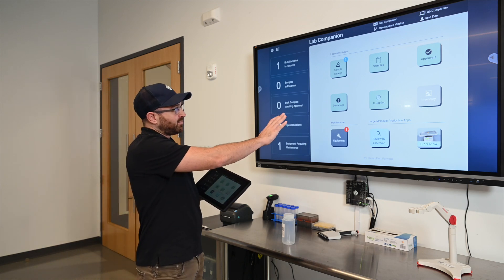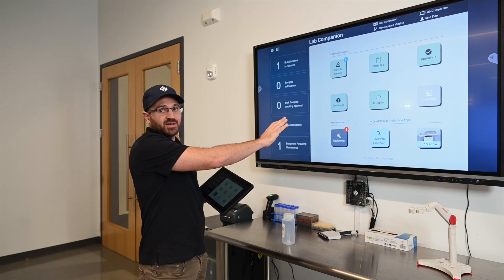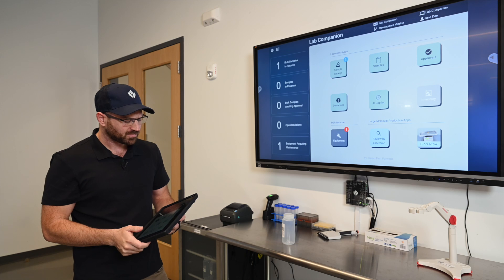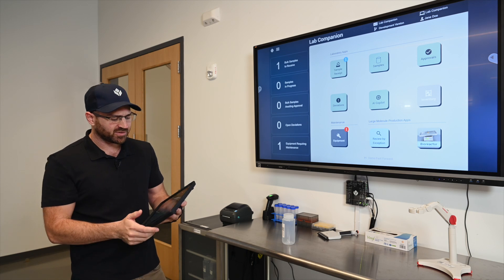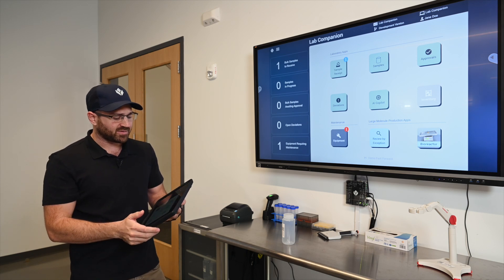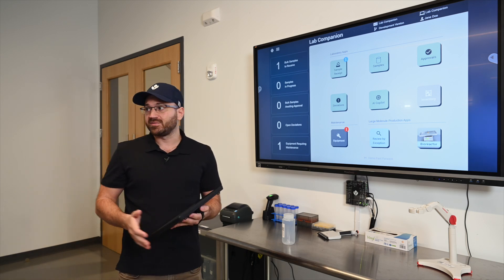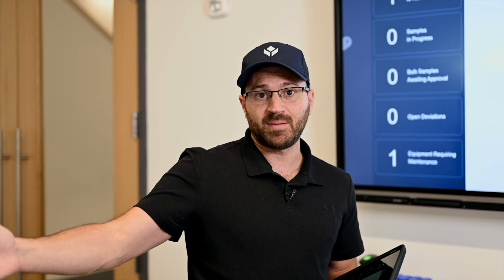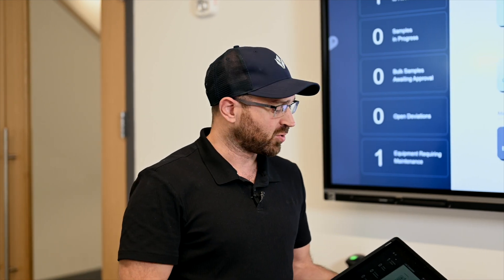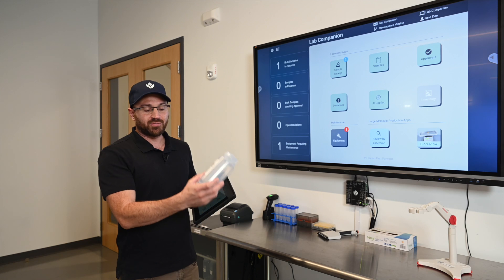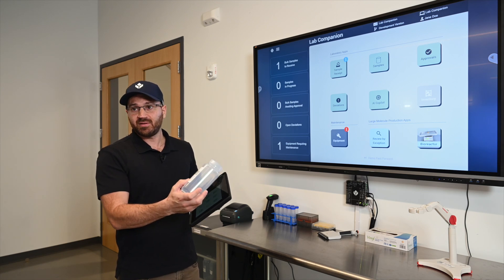The same thing is mirroring on the screen, but the same thing is happening on my tablet. So what does the lab do? The lab receives samples from production and is required to perform tests. We're going to receive this sample from the bioreactor and process it through the lab.